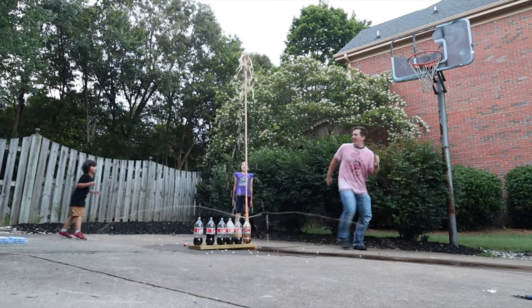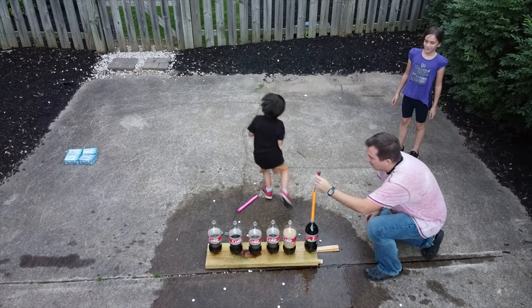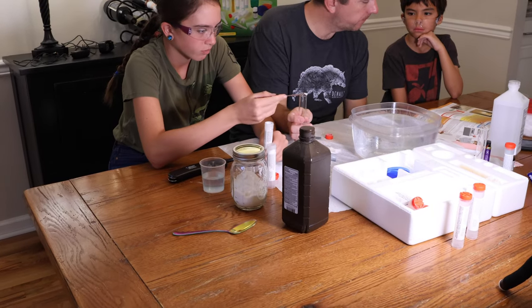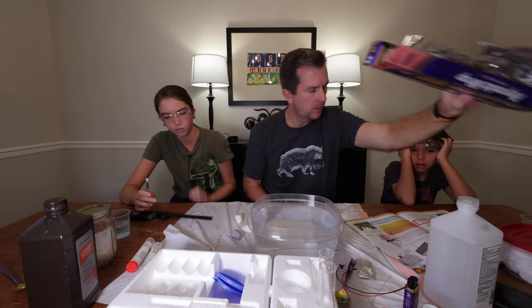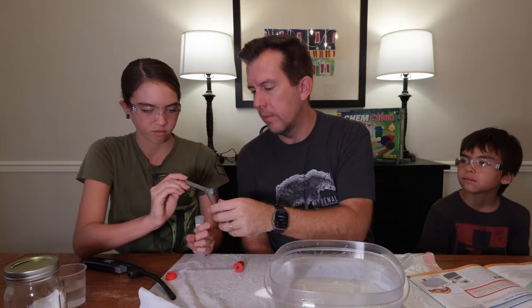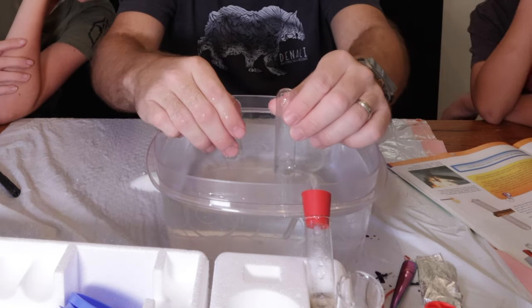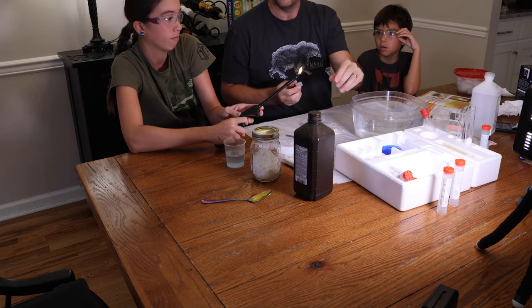That being said, if you want to see how many Mentos it takes to produce the higher geyser from a Diet Coke bottle, check out the video we did a couple of years ago — we figured it out. Getting back to the kit, in this experiment my kids and I are using some aluminum foil and a couple of the compounds that come with the kit to actually make hydrogen gas. Now, if your great-grandmother just so happened to be on the Hindenburg, then you know hydrogen gas is pretty flammable — which, after doing the experiment, is something we were able to recreate in our dining room.